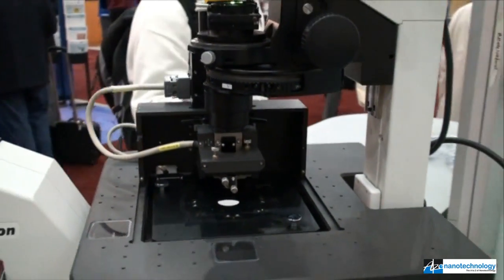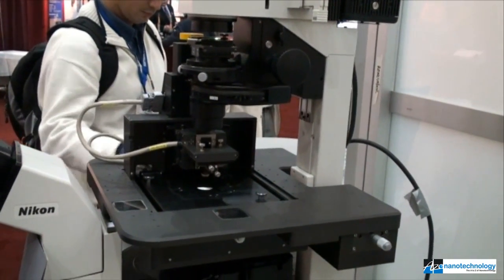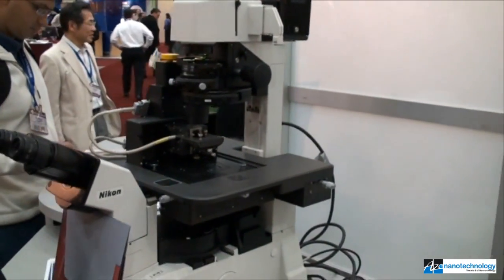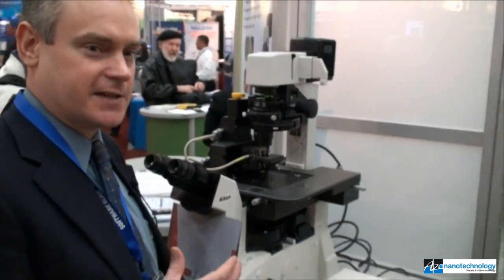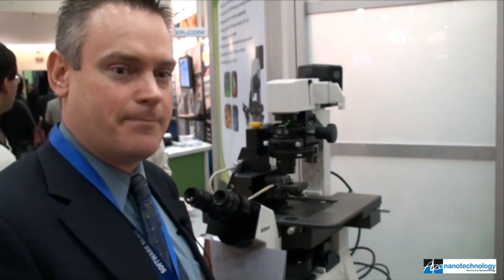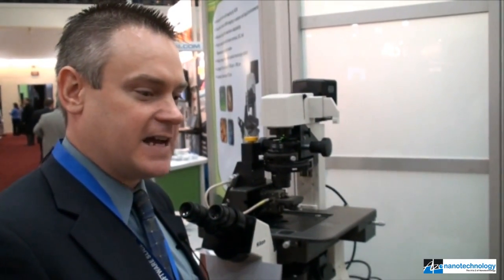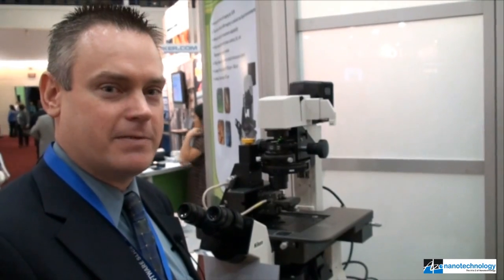The unique aspect of the XE-Bio is the SICM scanning mode that we have just developed. SICM stands for scanning ion conductance microscopy. Scanning ion conductance microscopy allows the user to easily and repeatedly scan living systems, scan a living cell in solution. Instead of using a standard AFM probe, for SICM we use a pulled quartz pipette that is attached to an electrode filled with electrolytic solution, or buffer solution. The living cell would be scanned in the buffer solution as well, with a feedback mechanism where a constant current is passed between the end of the pulled quartz probe and the cell being studied.